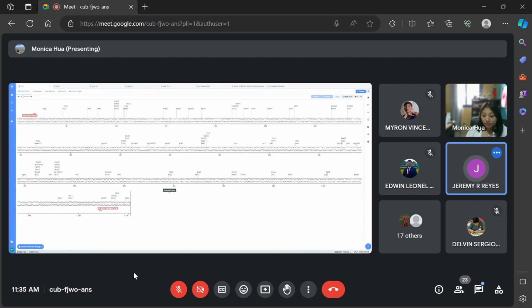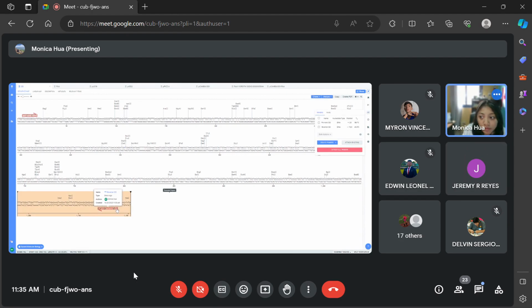Miss, I've got a question. What does the check secondary structure at a certain degree Celsius do? What does that feature do in the program? Like I said, each of these primers is single-stranded DNA, and usually DNA is double-stranded. They like to form hydrogen bonds.